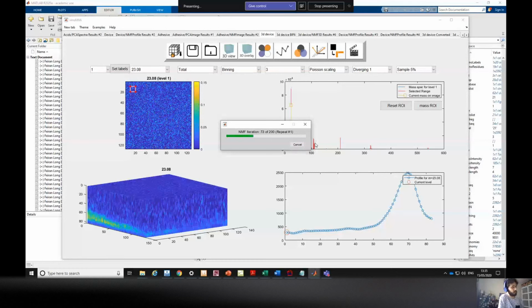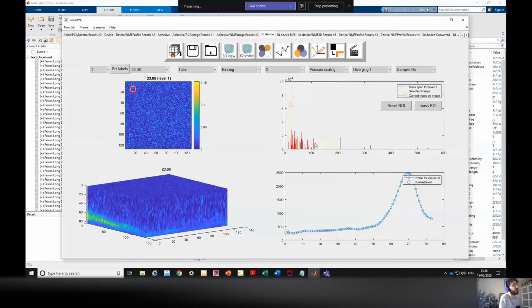Gus, could you give us a refresher why when we're doing NMF, we do not need to do any mean centering? It's because when you mean center, you bring values to negative numbers, because you'll be around 0. The new 0 is your average. So things under 0 are going to be lower than your average.